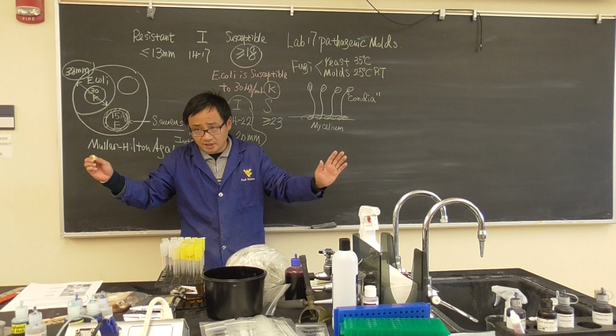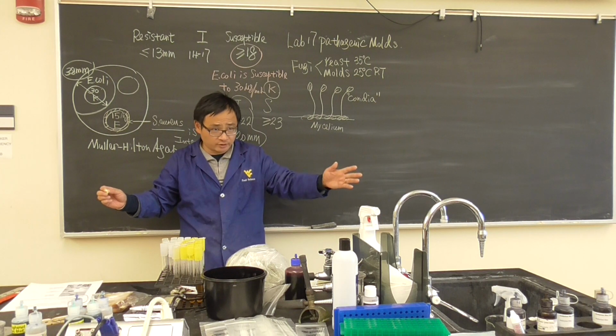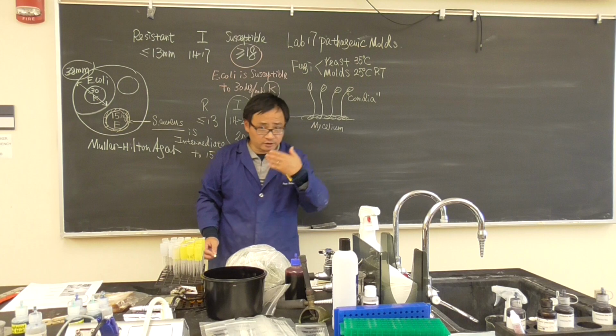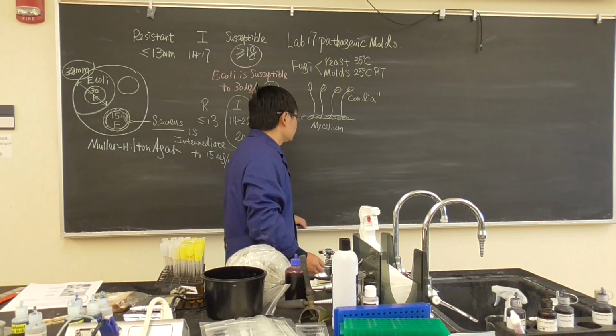Lots of the time it causes lung disease, like a pulmonary disease, like histoplasmosis. It's in the Ohio River, Kentucky, West Virginia area, and happens all the time. Lots of the times it also comes from bird droppings. Okay, the fecal sample. So this is basically what it looks like.